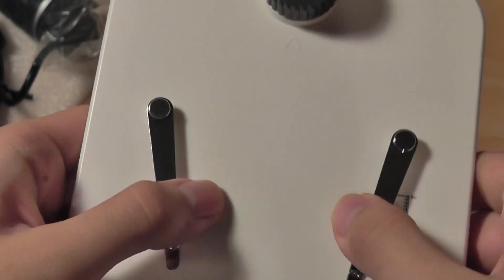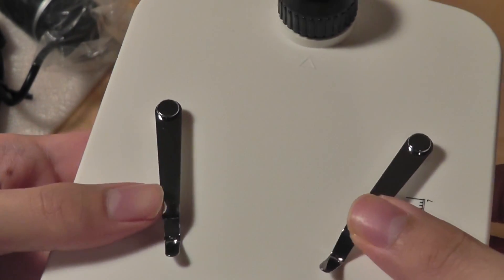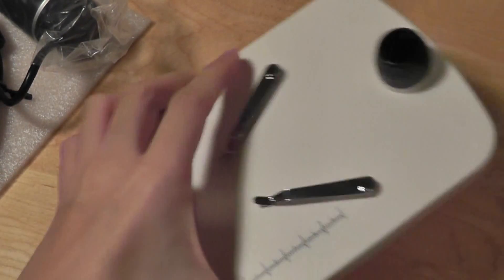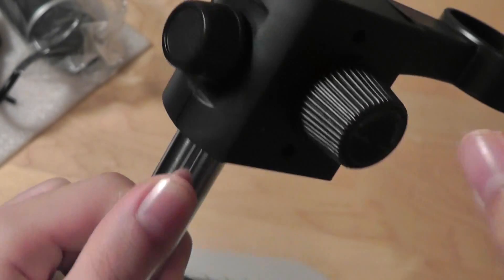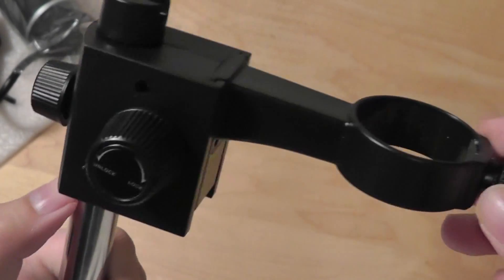There are two clips down below for you to get an accurate clamp on the petri dish or whatever you're trying to focus your subject on. Up here is where the dock for the pole is inserted. On the bottom there are four rubber feet which prevent the unit from sliding around on the desk. You also have various adjustments including locking and unlocking different parts, moving the slider up and down, and adjusting the angle.